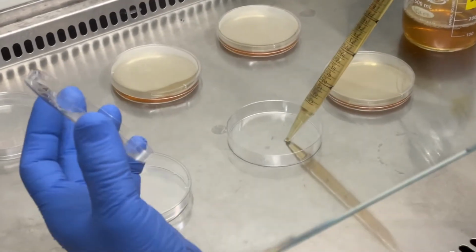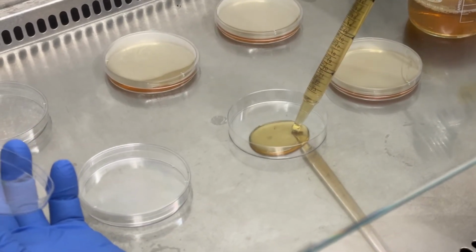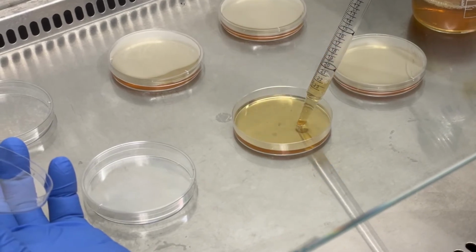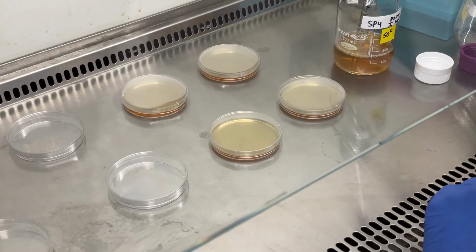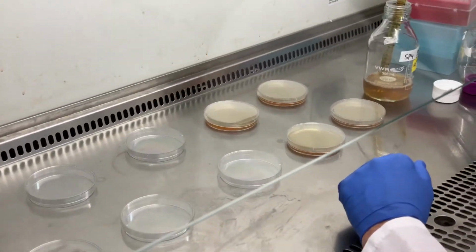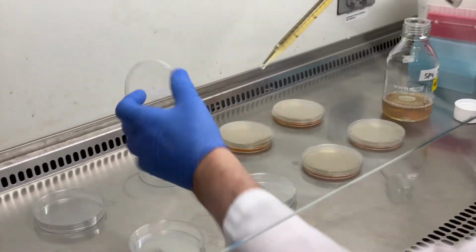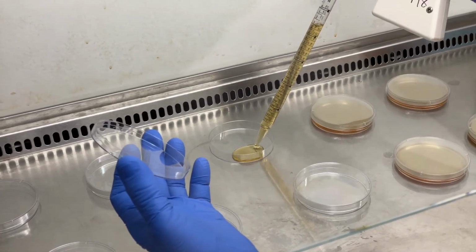This is absolutely not good for these plates because they contain proteinaceous materials, and this process essentially sears the surface and makes them unusable. So bubble removal is always important, but this is one method shown here that allows it to be done without any kind of denaturing process.